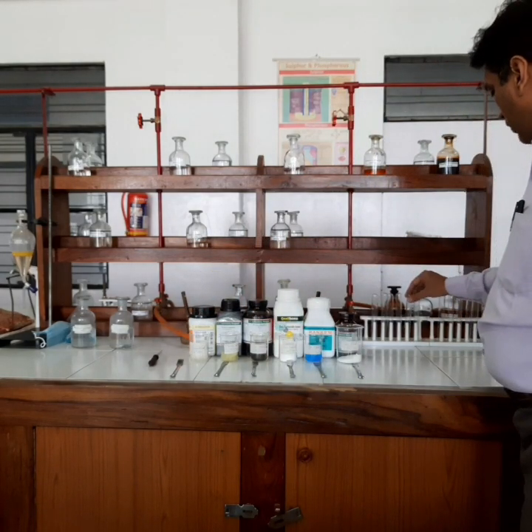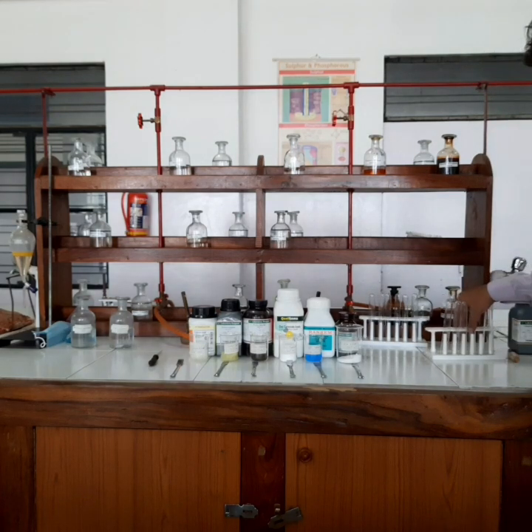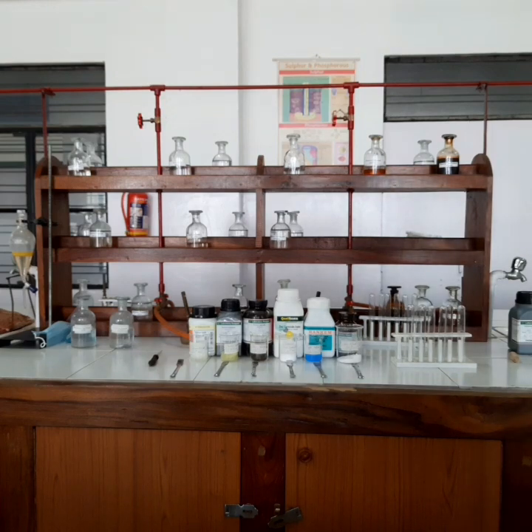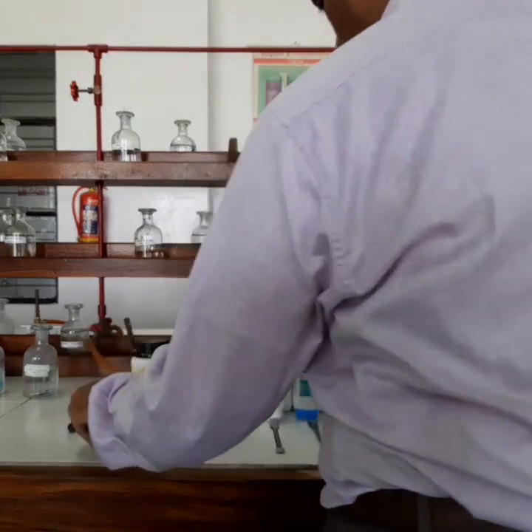Okay, now first of all, I am going to take NaOH, and let's perform the test with the NaOH. For that I am going to take the salt of calcium.